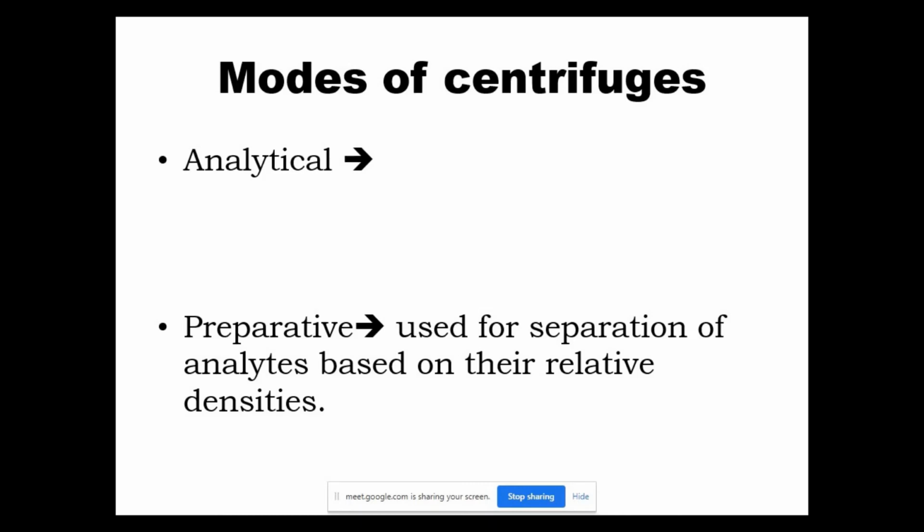You have collected the blood, and you have taken the blood in the anticoagulant. Now you will do the centrifugation. That's how your blood cells got separated.